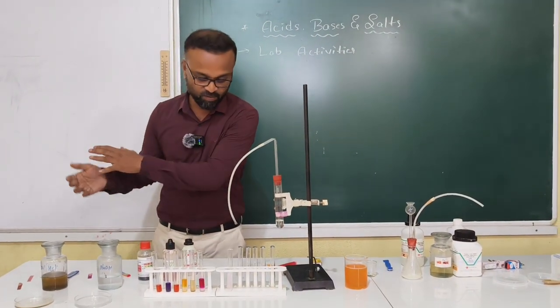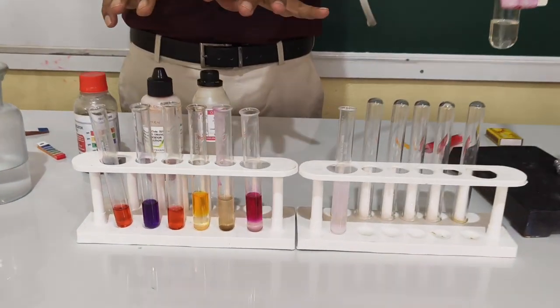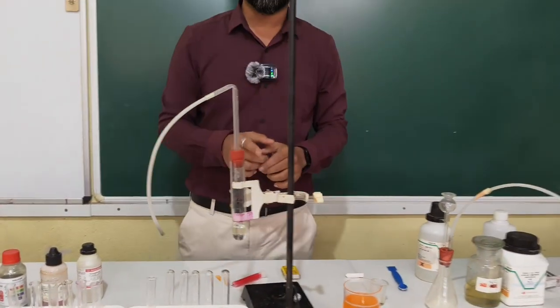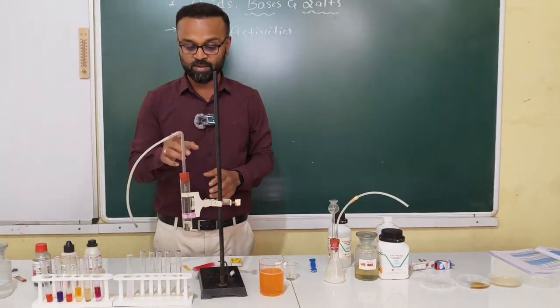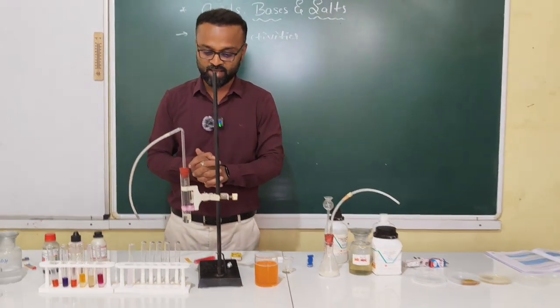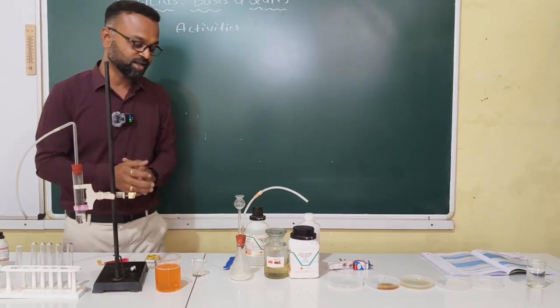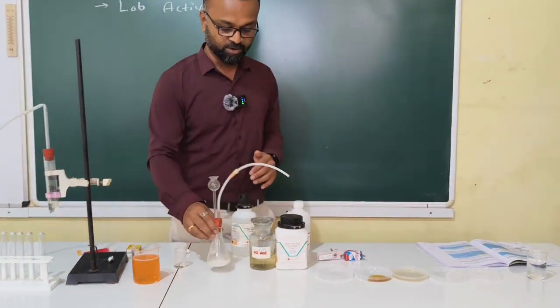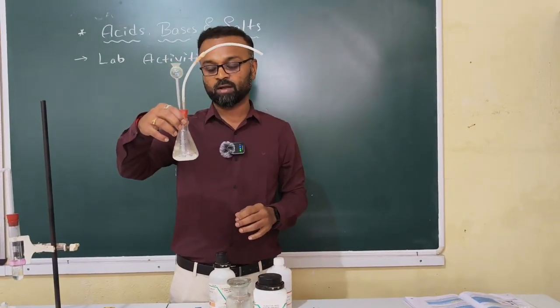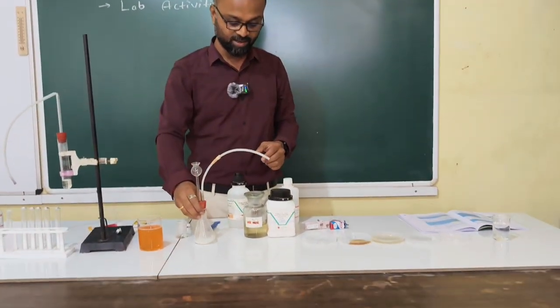And here we can see the beautiful colors over here. We all know the reason behind those colors. So this was a really interesting session, and this one is a very, very important diagram. In the midterm exam, they are going to ask this particular diagram, that is the reaction of zinc with HCl, the pop sound diagram, or the liberation of hydrogen gas we tested. And also we have tested for the liberation of carbon dioxide gas. When sodium carbonate reacted with sulfuric acid, there was a liberation of carbon dioxide gas, and we passed it into the lime water.